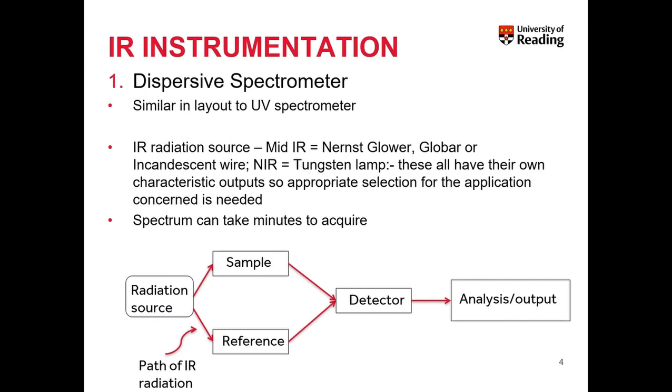Just like with UV visible spectroscopy, this is a very quick and easy method to run. You can acquire a spectrum in several minutes, and this technique is also amenable to things like automation.